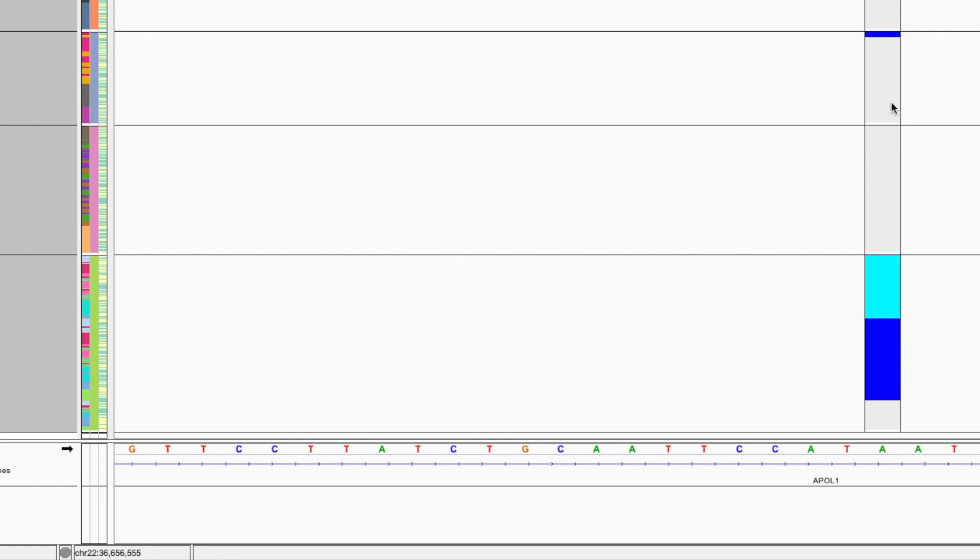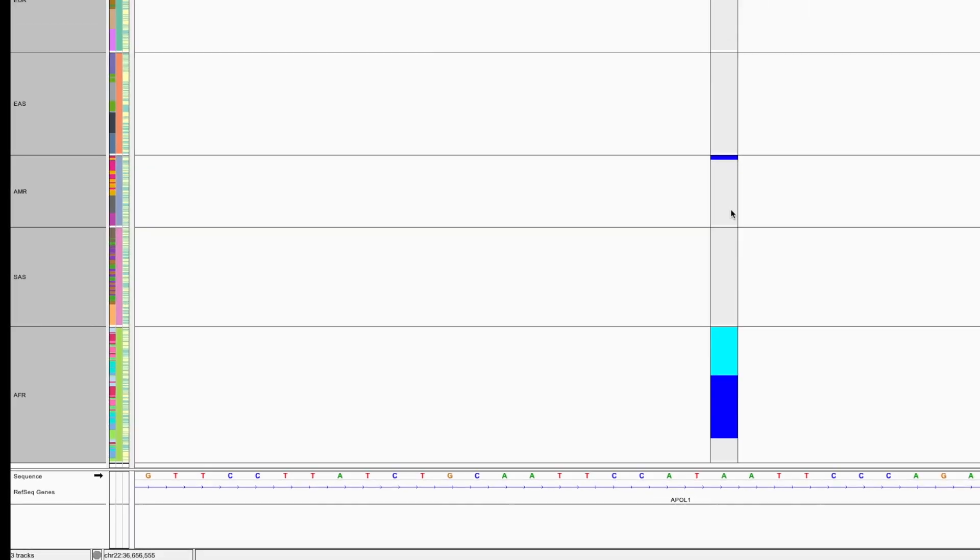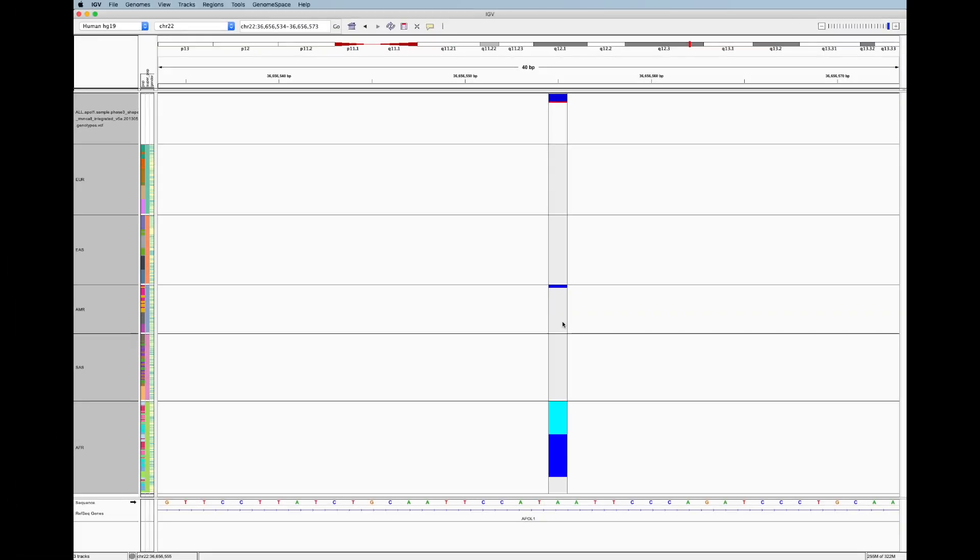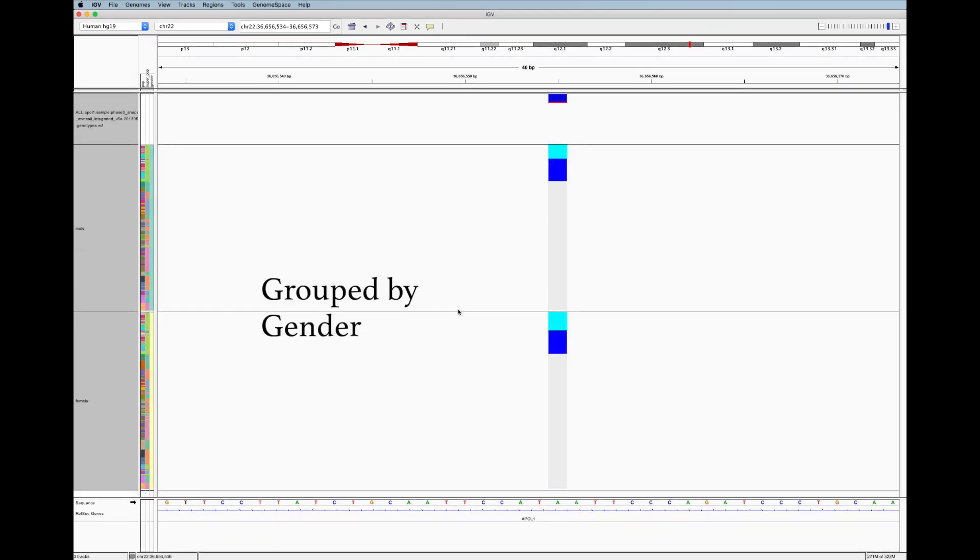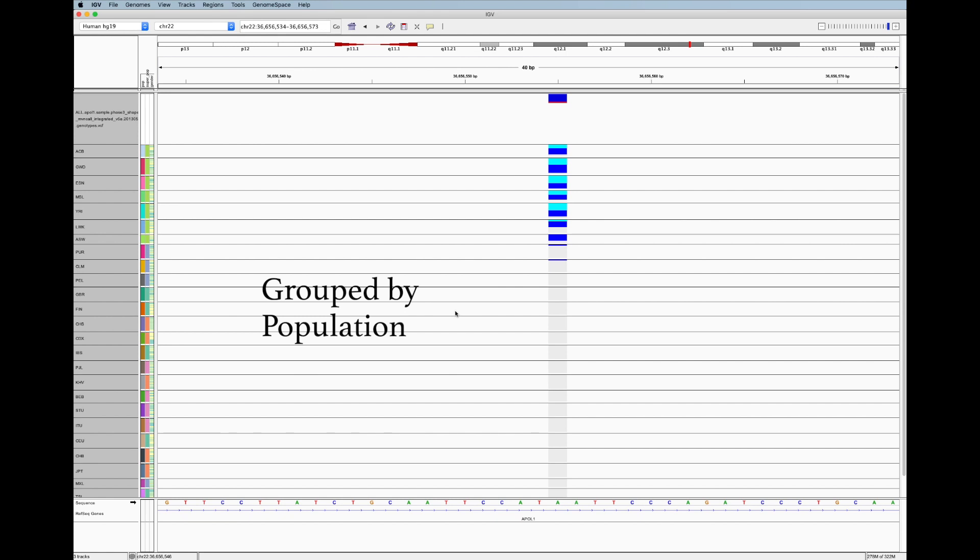So just like we grouped superpopulations and found this interesting variant, we can do the same with our other sample annotations like gender or populations.